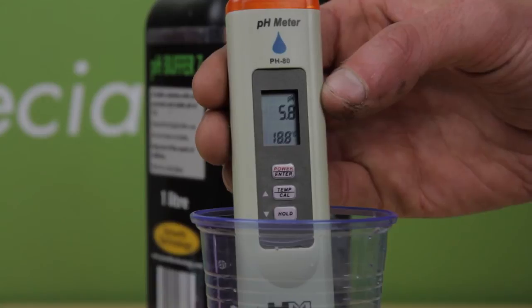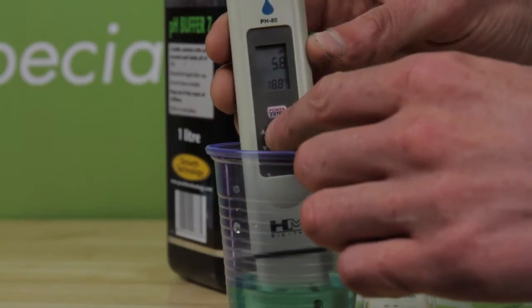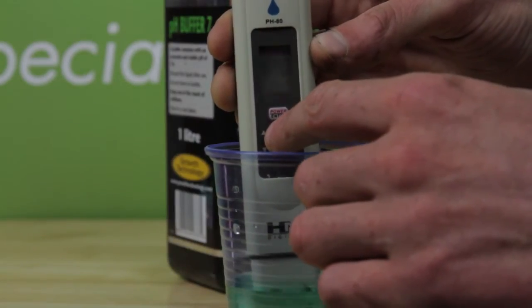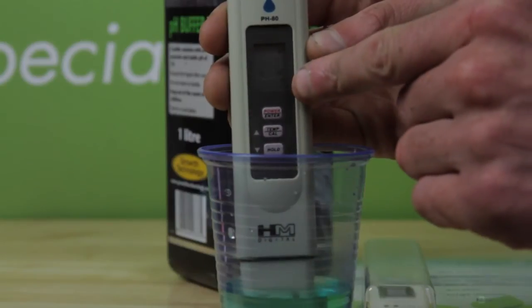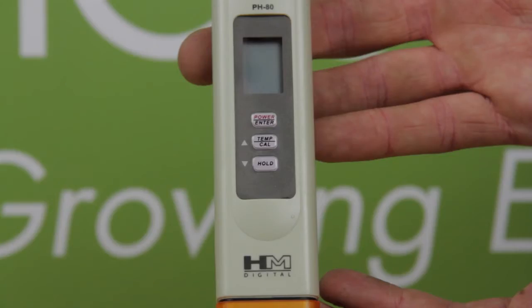We know the pen is giving us a false reading. Now press and hold the central button marked temp/CAL until the LCD screen starts to flash CAL, as you can see in the image. The temp/CAL and hold buttons both have arrows next to them.